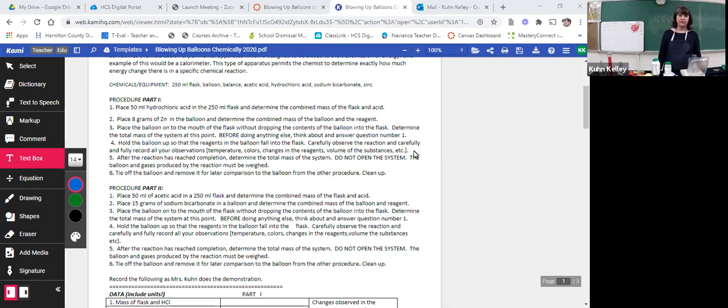I am going to read through the steps as we go through this process, just to kind of model how you work through labs. Normally you would be doing this lab in person. It's not that hazardous. We do have some chemicals we have to be aware of. So just as a tiny bit of a safety lesson as part of this, I will be wearing goggles and aprons the entire lab. My most dangerous chemical that I'm working with is hydrochloric acid.